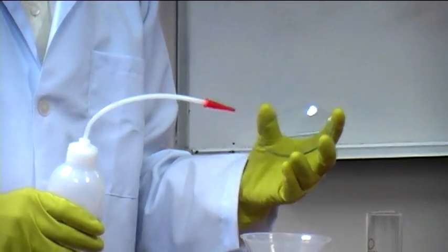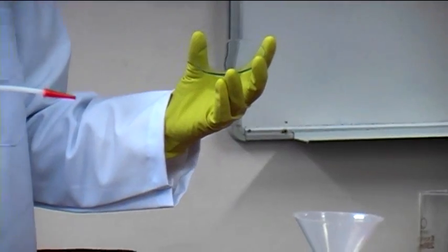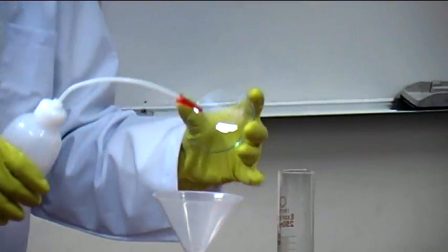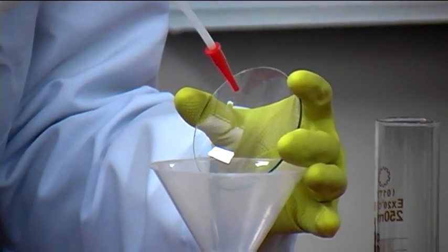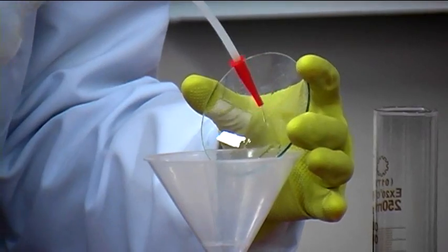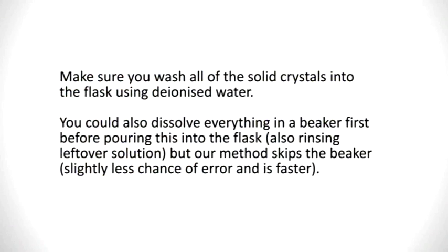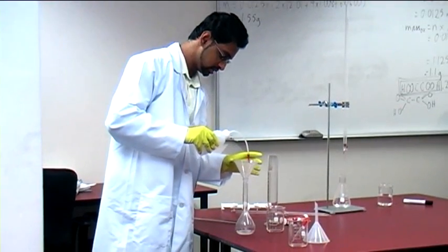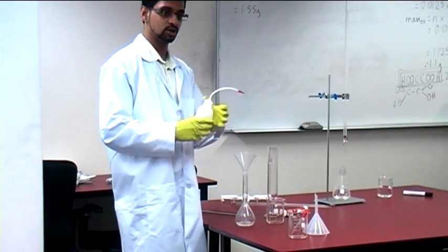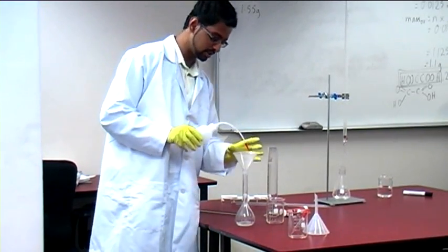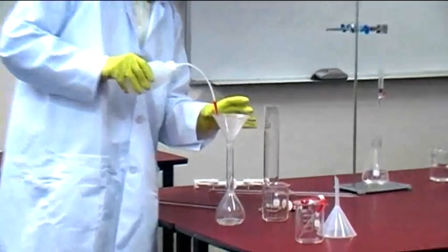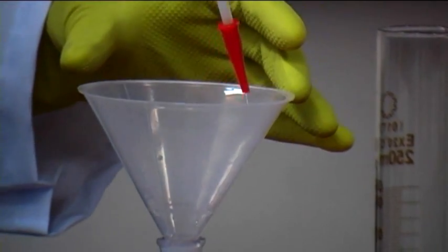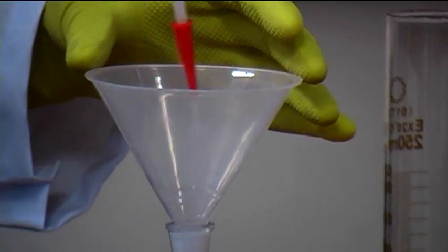I've got my watch glass and I've tried to get as much oxalic acid in there as possible. I know I probably haven't gotten all of it, so I'm going to use water to wash the rest down. Notice I'm using a squirt bottle to squirt around the sides of the funnel, to make sure any remaining oxalic acid also goes in. I need to ensure all the mass I weighed out actually gets into the flask.